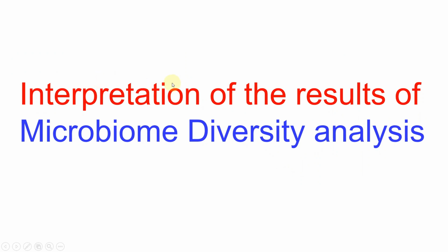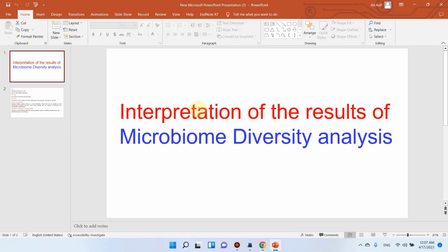In this video, I will show you an overview of how we can interpret the results of microbiome diversity analysis. I will show you the website by which we have analyzed our data, and I will also show how we can interpret the results, which can be used in our research articles. So let me go to that website.